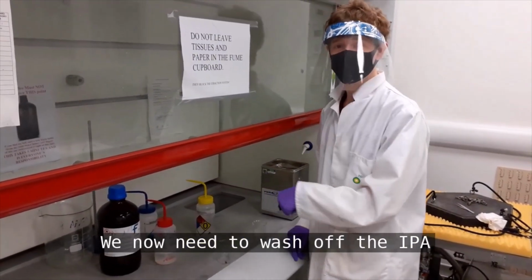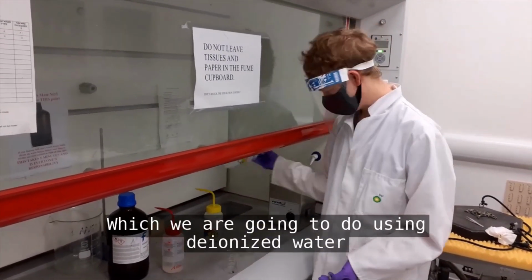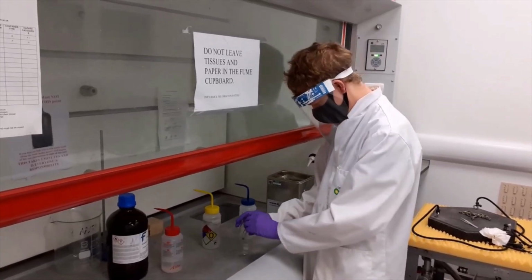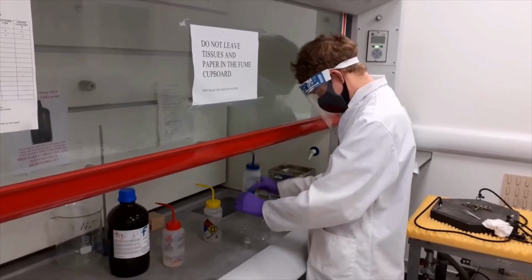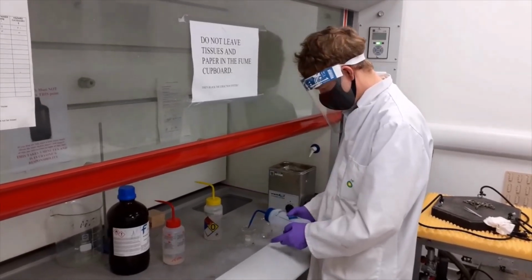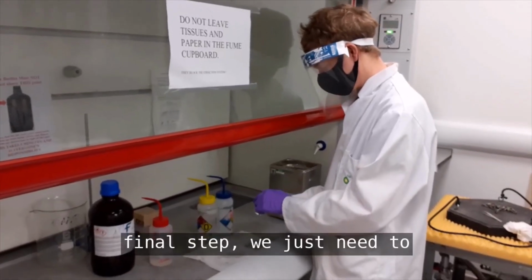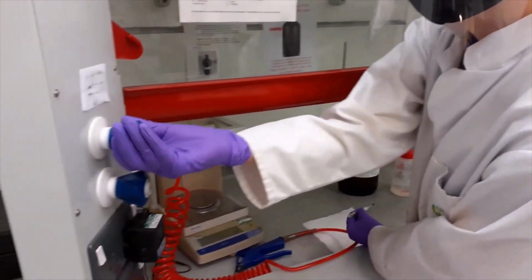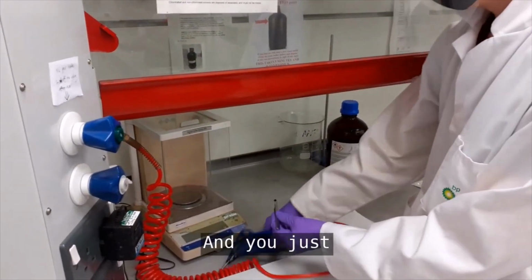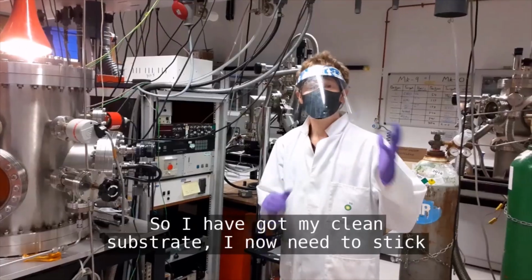We now need to wash off the IPA, which we're going to do using deionized water. Alright, the IPA is off. Final step, we just need to get rid of the water. So, come over here and we just dry it with nitrogen gas. I've got my clean substrate.